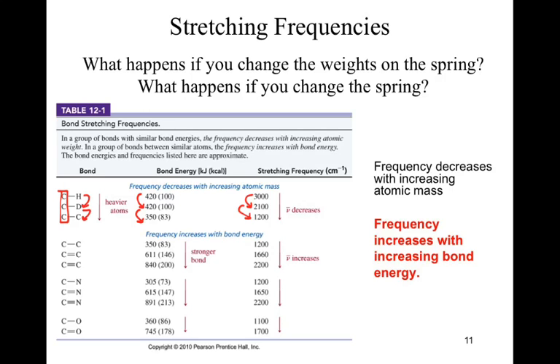Okay? The more important one that will show up at very least at the very end of this is that our frequency is going to increase with increasing bond energy. So as we make a stronger bond, we see the frequency increase. So the big nice comparison here is if we take a look at moving from a triple to a double to a single, we end up seeing the energy of the bond change, and hence also the frequencies.